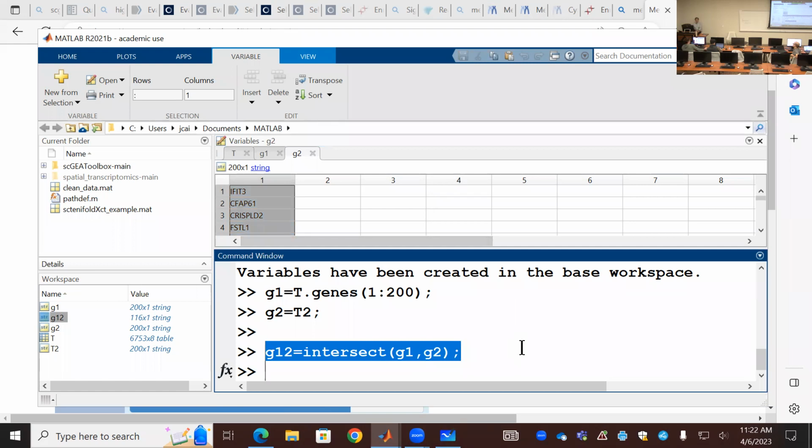I think for enrichment analysis, 100, 150, 200 is all fine. You can try and see, okay, if I use top 100, whether I got highly similar results from 200 genes. There's no fixed cutoff. I don't know. Yeah, you can try both methods.